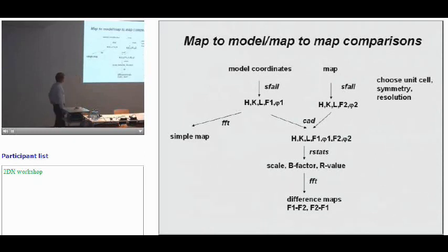So I thought I should also include another scheme here, one application, maybe a little bit more general, that can also be used in single particle cryo-EM. So I was interested in validating single particle cryo-EM maps, and we heard a lot about this from Richard Henderson on Wednesday evening, in a very general perspective, when you have no prior information about your structures.